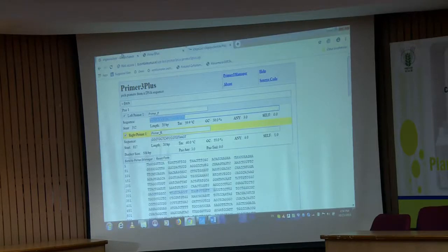You can do it manually also, but you can put that region. Let us suppose you pick sequences from the BLAST you did for your particular sequence. Around 10-15 sequences you picked from the BLAST hit table, and you downloaded those sequences. Now, when you are multiple aligning those, you will pick the region which is actually similar among all, and then you can design the primer.